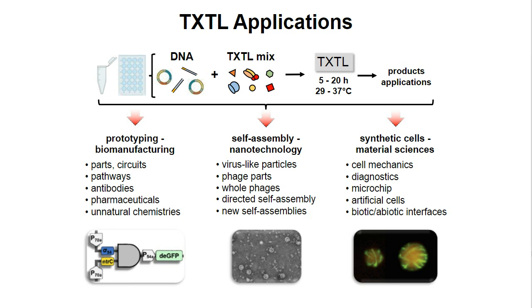You can direct some self-assembly, and you can also study some new self-assemblies, as you can see just below in this electron microscopy image, where the phage T7 was entirely expressed and synthesized.